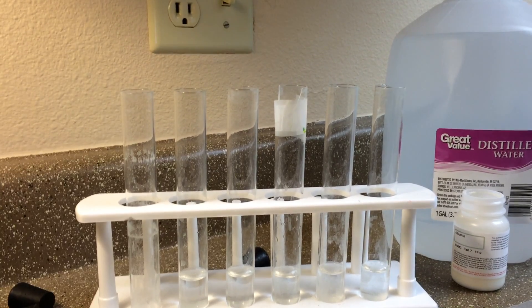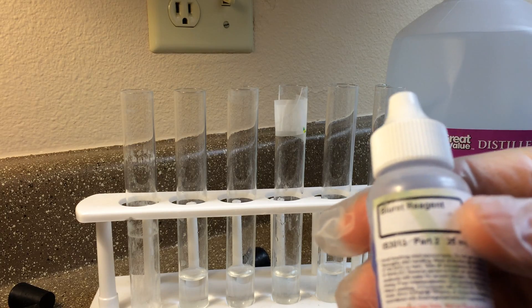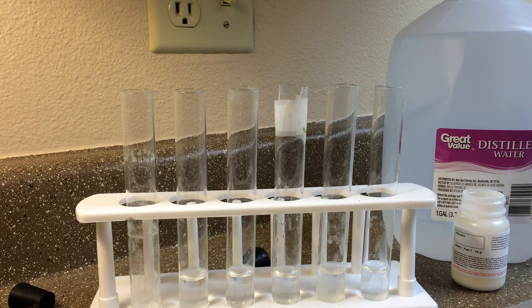We're going to do a Biuret reagent experiment. What Biuret reagent does is it detects the amount of protein in a solution. It looks purple in here, but it's a lighter blue color when we put it into distilled water. We'll go ahead and do that.